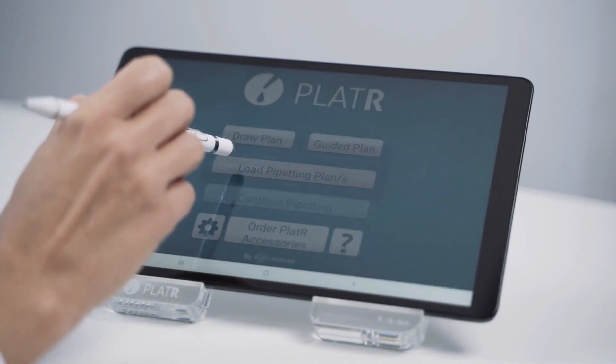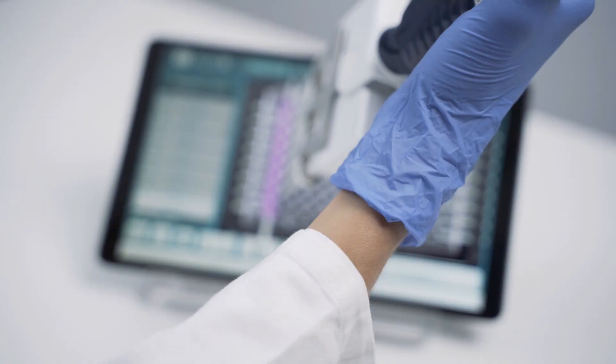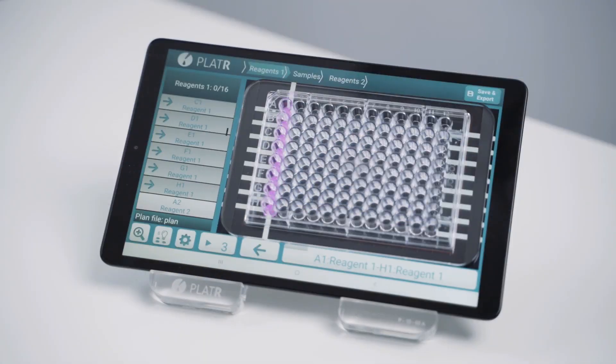Plater is a tablet application that illuminates the wells on your 96 or 384 well plates. With Plater, manual pipetting is much easier and the days of your pipetting mistakes are over.